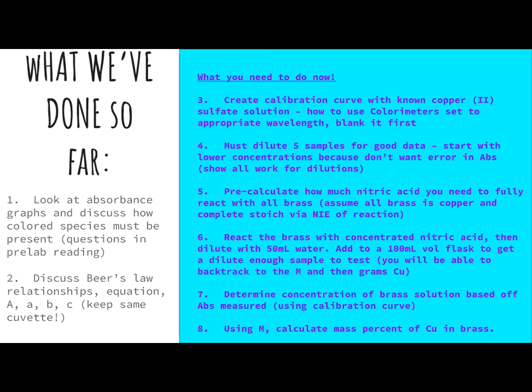So, guys, listen, just to get you started here, you have cuvettes. There are already 3 solutions floating around: 0.4, 0.5, and 1 molar. I have lots of little volumetrics if you wish to prep a different molarity solution, or you can do it in a test tube like we did last time, where you put 5 of one and 5 of water, and that will get you half the concentration. Okay? So you have plenty to work with here.